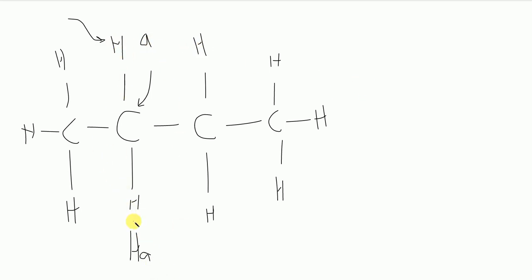They're both the same because they have the same chemistry, okay? So this environment right here and its hydrogens, these two are the same, right? They're both the same chemistry-wise. So whether I'm talking about this one or this one, they're both referred to as HA, okay? And the same thing goes for these over here as well. This is a symmetric molecule. These would also be HA hydrogens, okay? And there's special rules for all this that I'll have to go into.